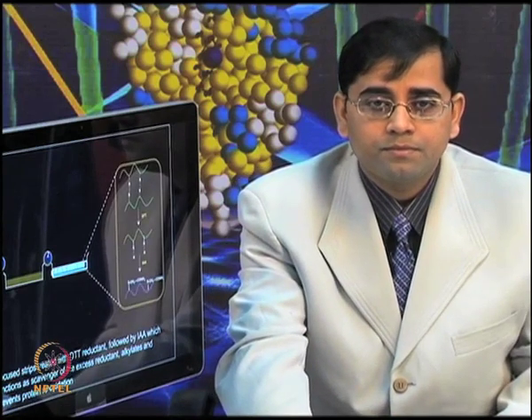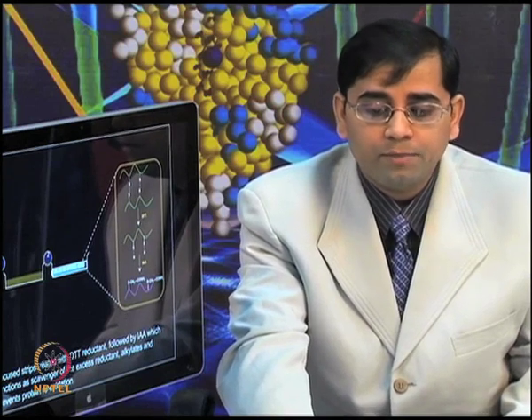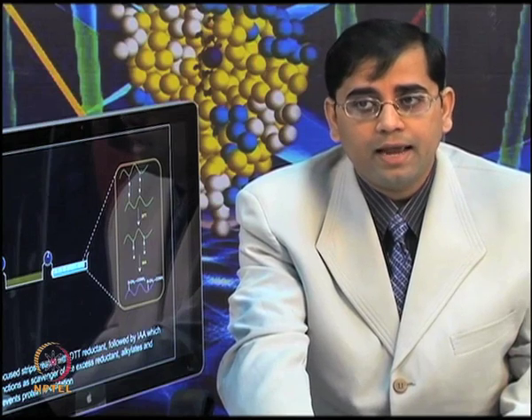The DTT reductant is used for the first step, followed by IAA, iodoacetamide, which functions as a scavenger of the excess reductant, alkylates, and prevents reoxidation. Here you can see how different bonds are broken from the disulfide, and IAA prevents the reoxidation by alkylating these residues.